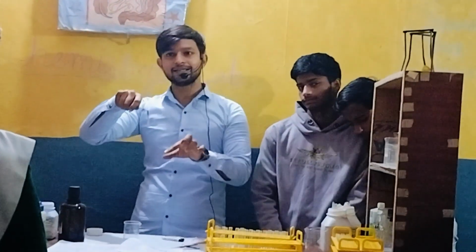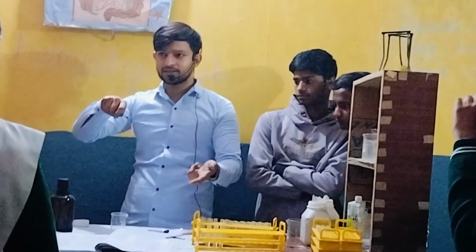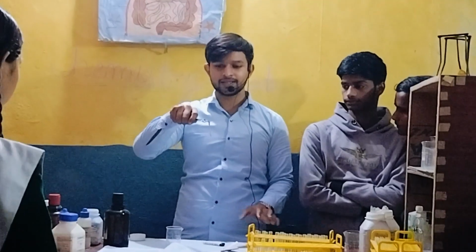Please see. Has the color changed? No, it is red in color. So it confirmed that when we add red litmus paper into base, then it changed into blue. And when we add it into acid, then the color will not change. It remains red. Okay.